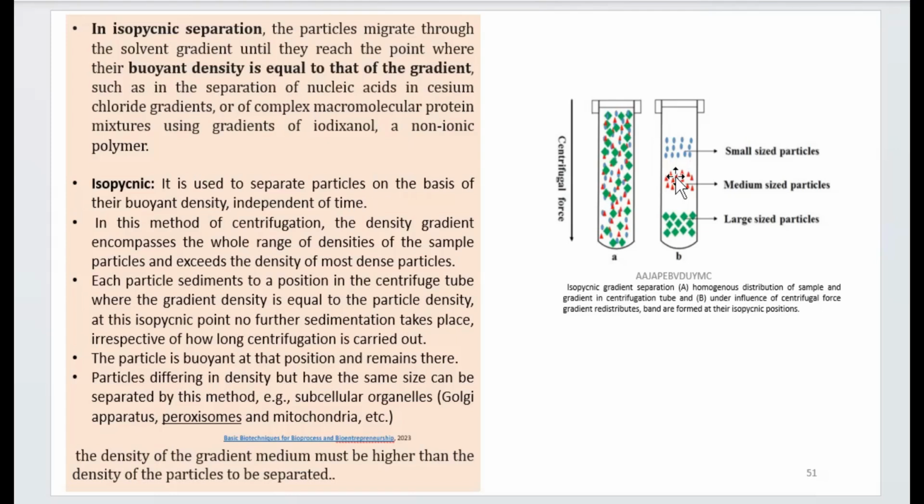Even if centrifugation continues after that, there is not going to be any more separation. However long you continue the centrifugation, further sedimentation will not take place. The particle is buoyant at that position and remains there. When I say buoyant, that means the density of the medium is more than the density of the particle.